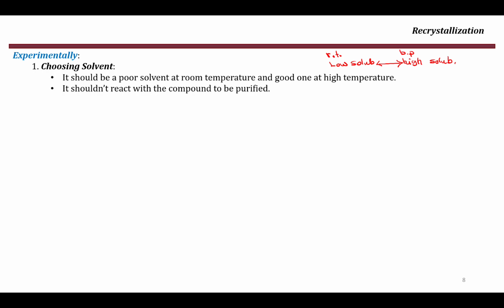The second thing is that you have to be careful to choose a solvent which doesn't react with your compound. This is something you don't have to think about right now; it's basically something we do in research labs. The other thing is that it shouldn't solidify upon cooling. Usually, as you will see later on, once we finish the recrystallization process, we cool our solution.